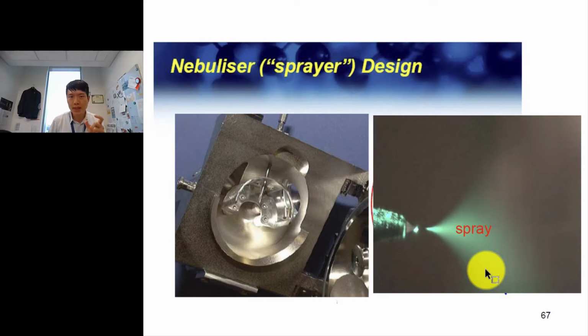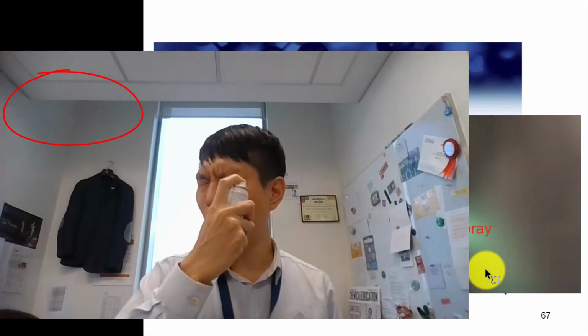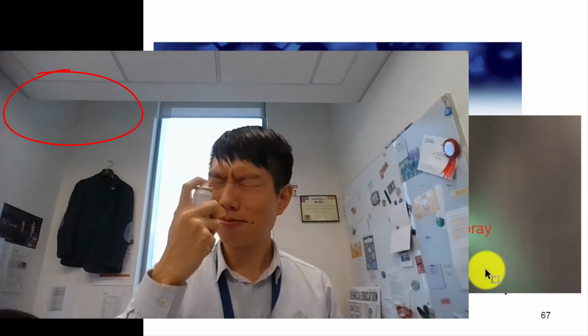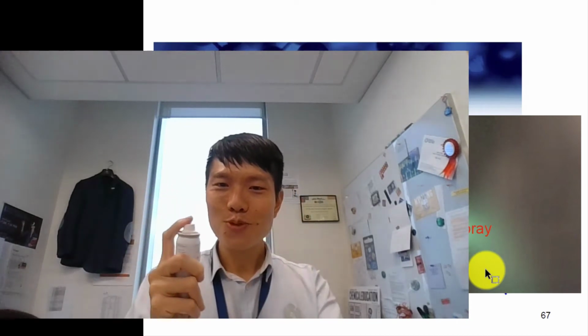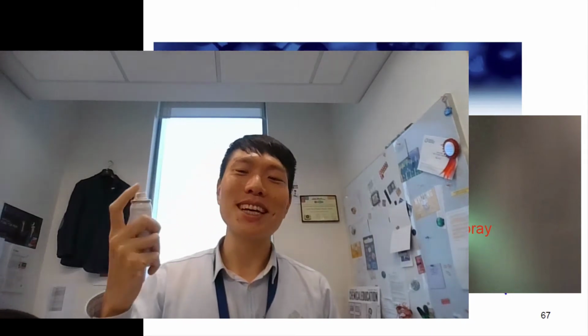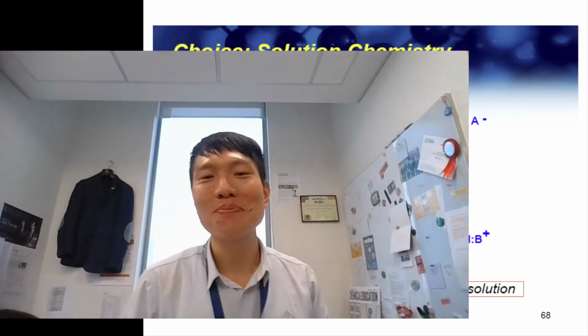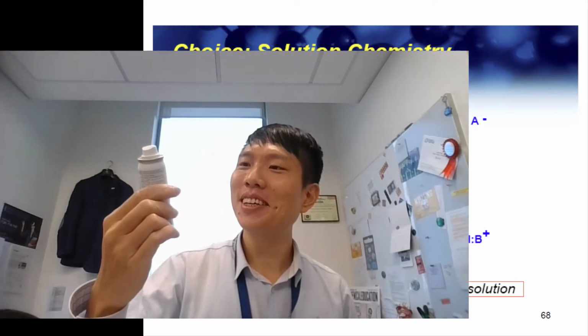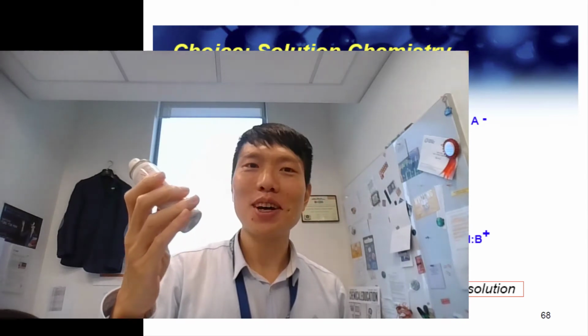Here is how it looks for the nebulizer, the spray. So here we have just a spray, right? You can't see the orifice, the hole. One more time, because it's refreshing. Can you hear the sound, by the way? Okay, the spray. When you see this, on the right side, here's what happens in slow motion, if you can see. A very small, tiny hole opening. Question for you: do you think it's charged? This droplet, thermal spring water, is it charged? You can try at home.